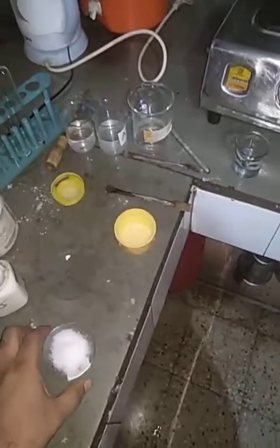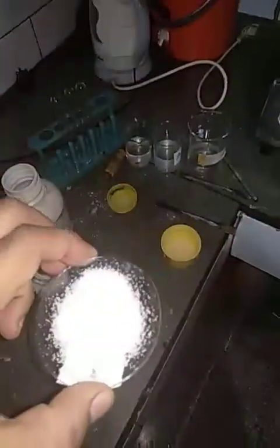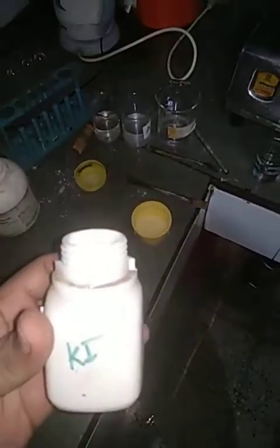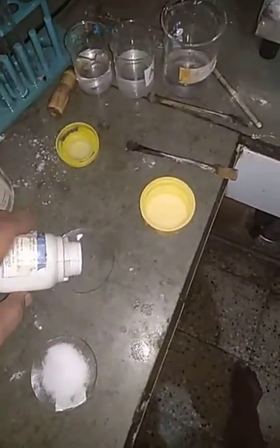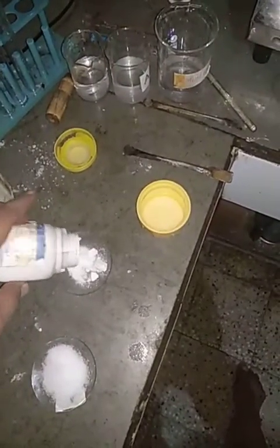Hello dear students, we want to study the properties of ionic compounds. The first ionic compound that we have in this watch glass is sodium chloride. The other ionic compound that we have taken as a sample is potassium iodide. This potassium iodide I am going to take out into another watch glass.